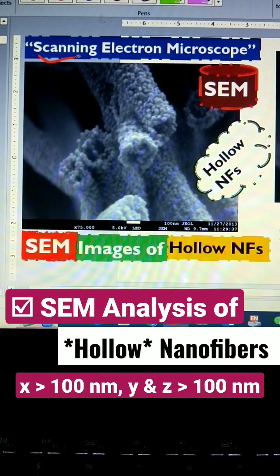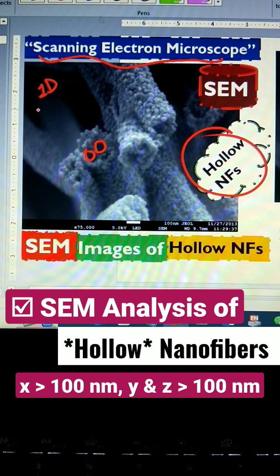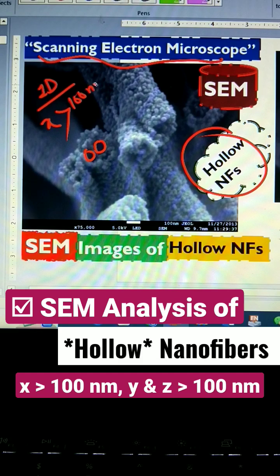Let us discuss the scanning electron microscopy images of hollow nano fibers. You can see that the fibers are hollow and have pores. Nano fibers are basically one-dimensional nanomaterials, meaning one of their dimensions — let's suppose x — must be greater than 100 nanometers, while the other two dimensions, y and z, must be less than 100 nanometers.